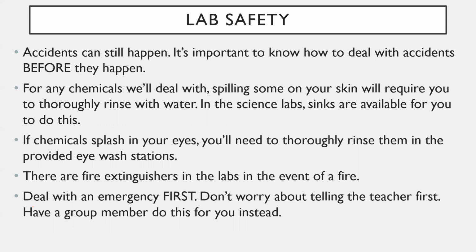Now, a really important point that you need to have totally understood is this last point right here. Deal with an emergency first. If you get chemical inside your eyes or on your skin or anything like that, that is your number one priority to deal with. Do not worry about telling your teacher about it first. I know how backwards that sounds. You're always told, tell your teacher whenever something happens. No, in this case, if you get something on your skin, deal with that first.